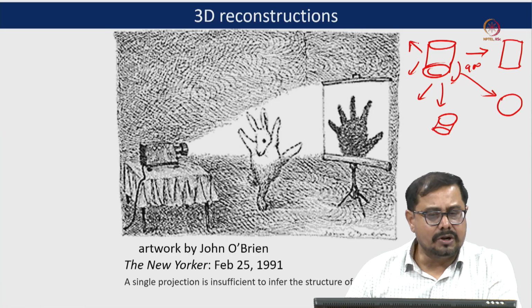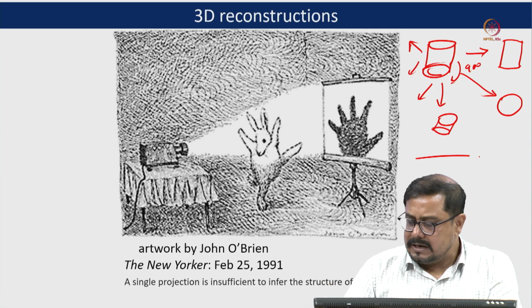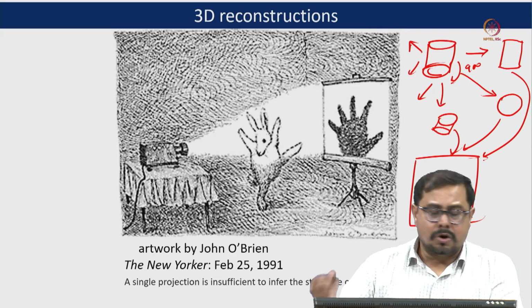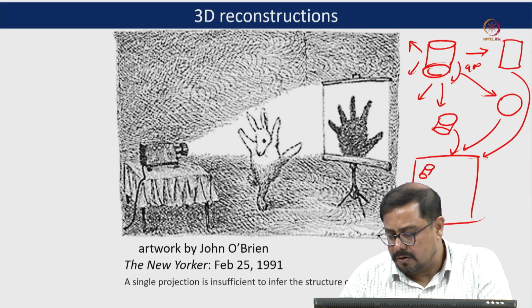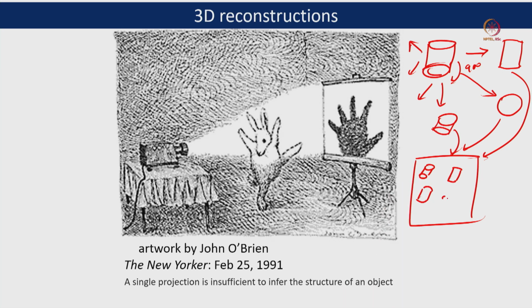Now when we are doing imaging, in this 2D we should get all these three projections. So in this particular case we may get all of these projections. If we are getting all of these, it means it is well distributed and we can find different orientations. So we can add all of them together and back project them to get a 3D structure.